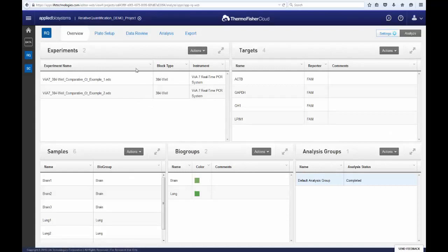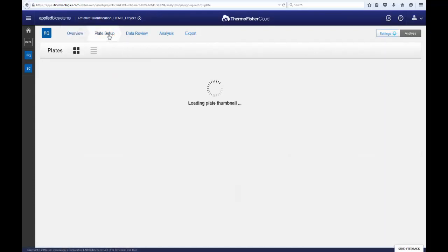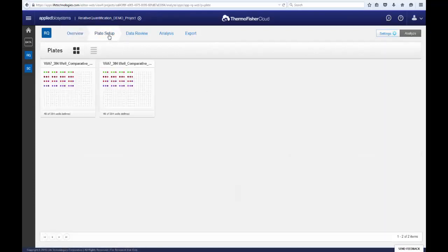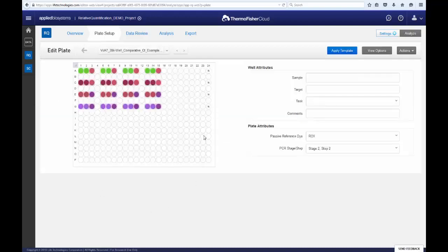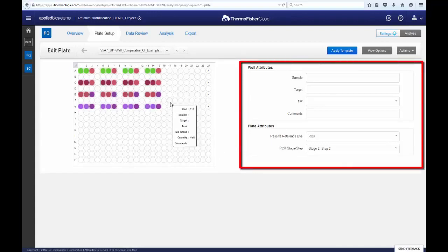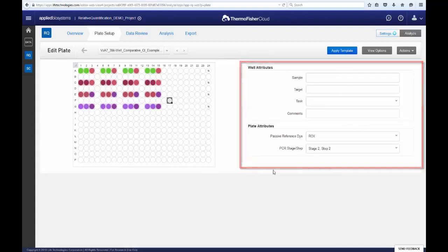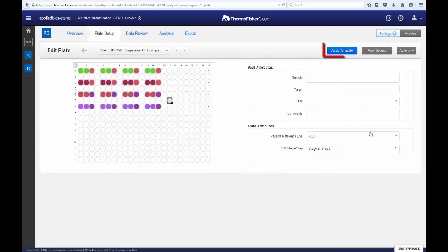Let's go to the Plate Setup tab and check its configuration. This is the Plate Setup page, where you can view the well assignments for your various plates. Clicking on a plate brings us to the detailed plate view, where you can make edits to the well assignments if you made any mistakes. You can also apply predefined templates as well.